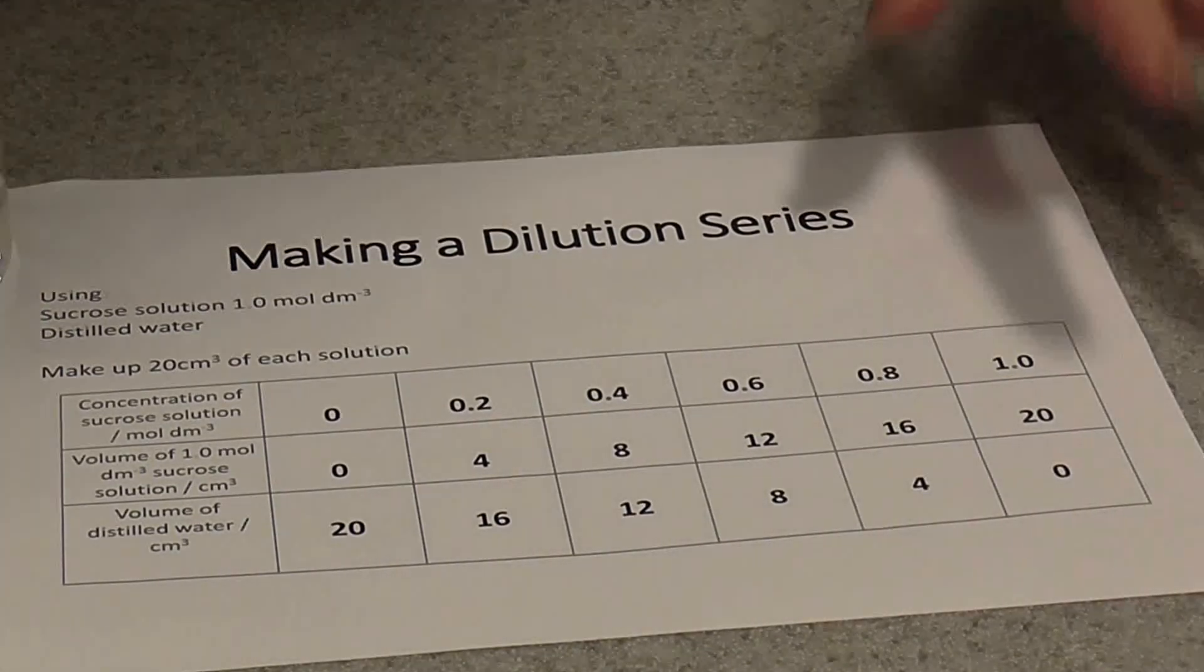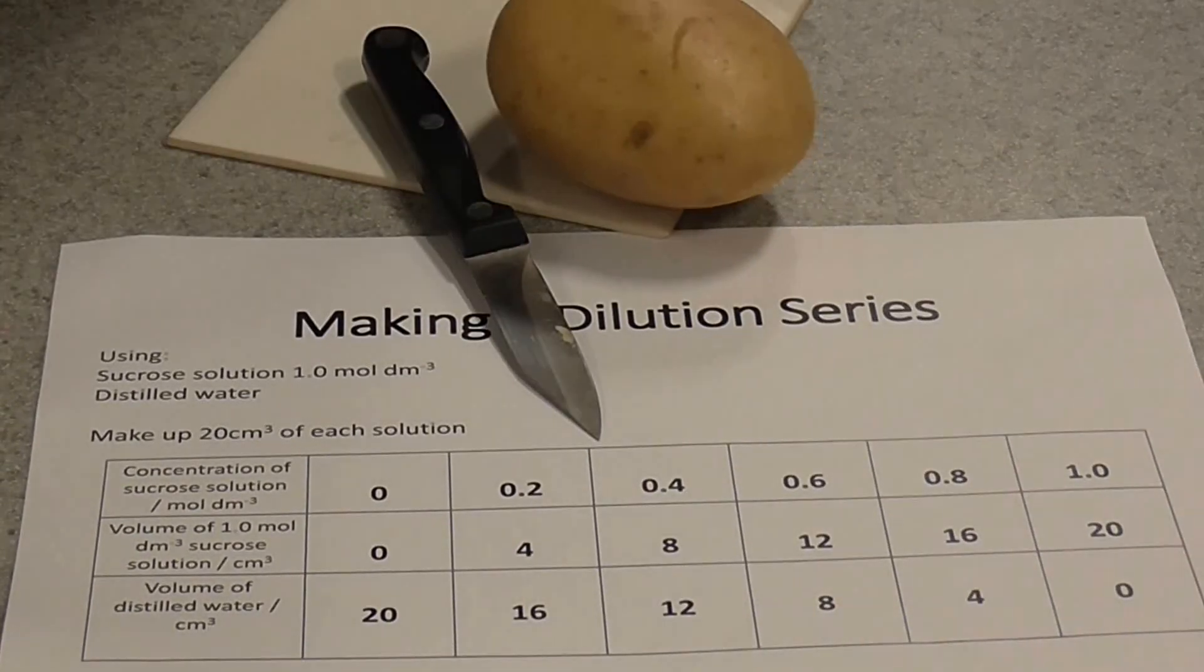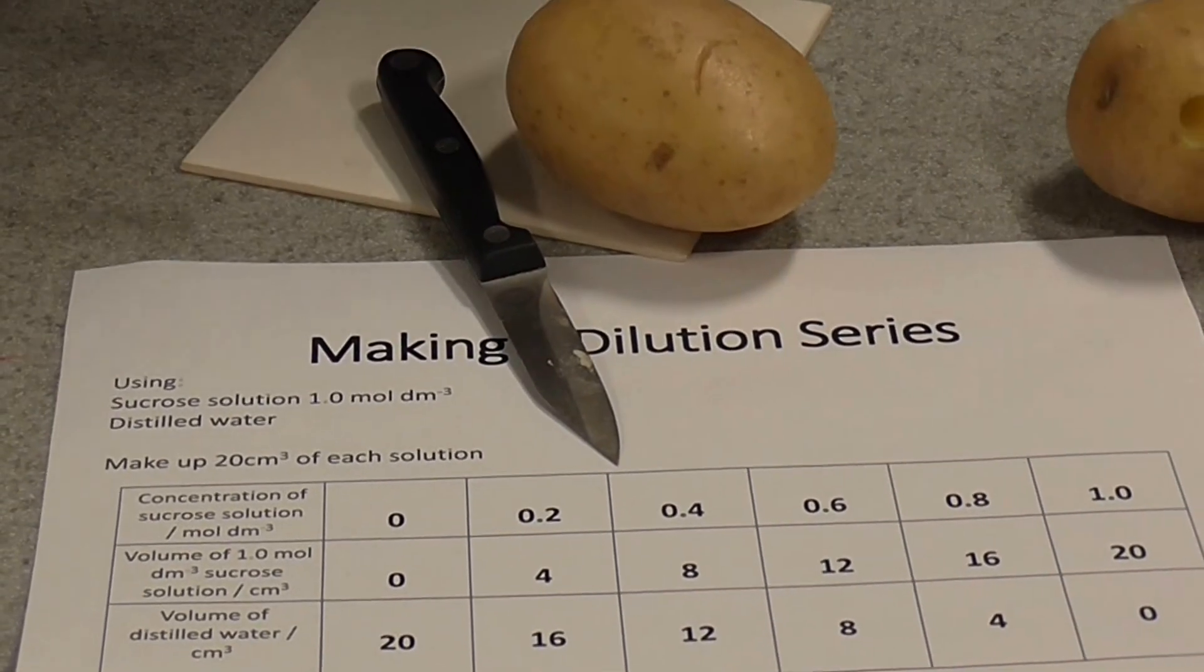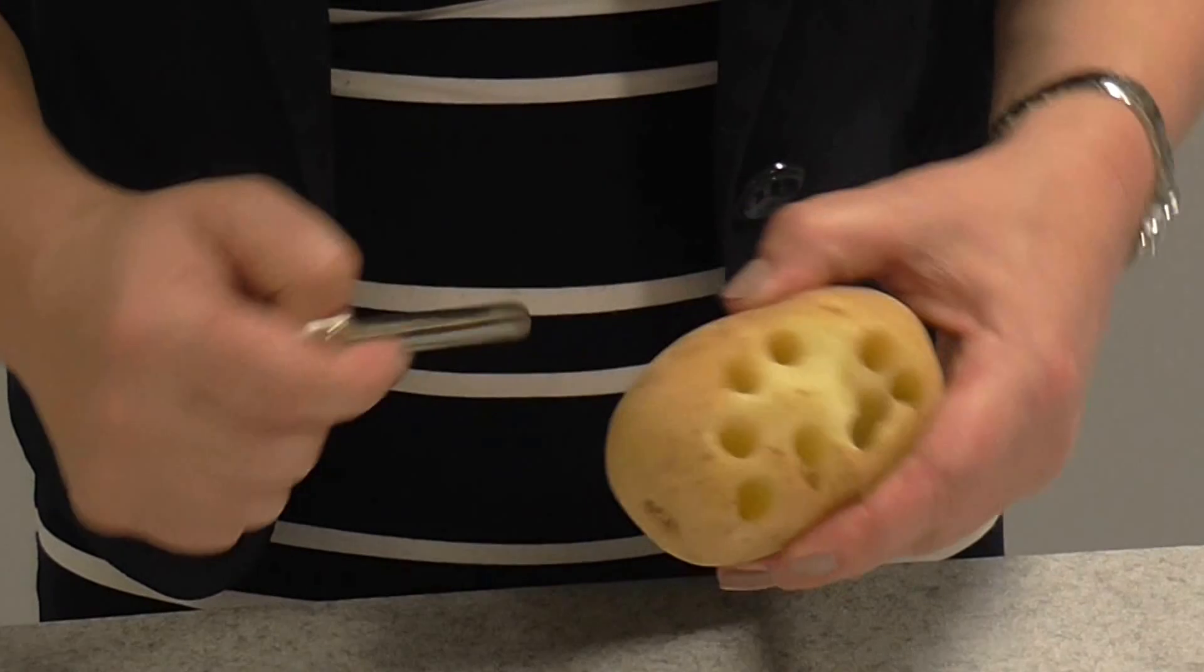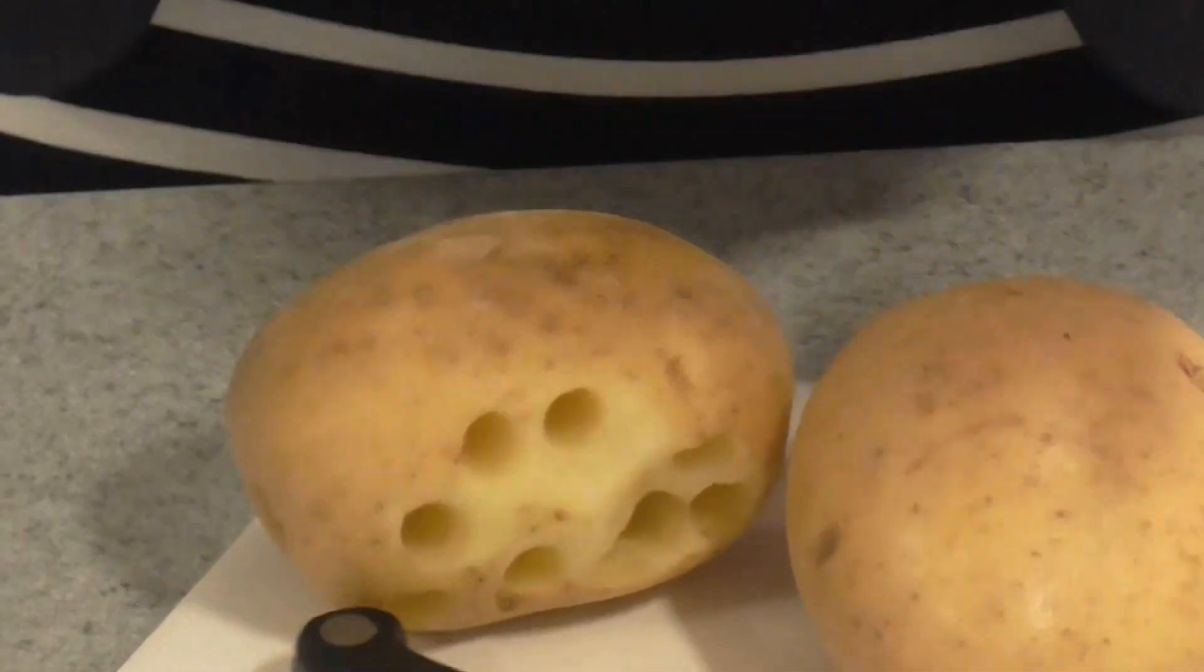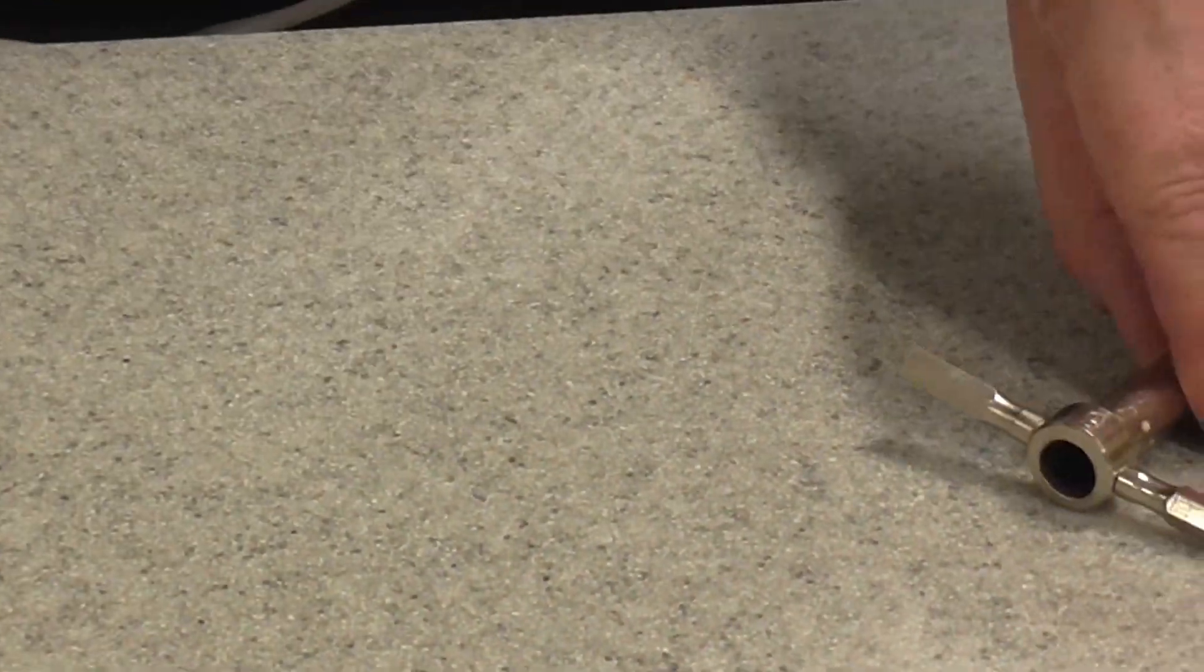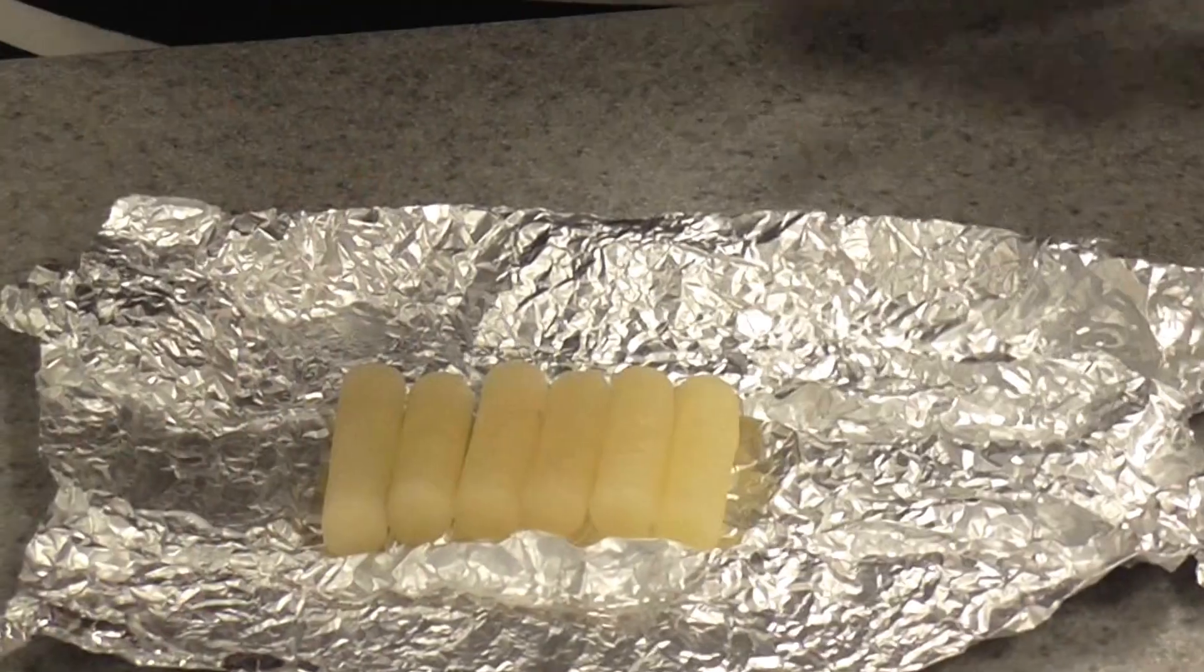Right now while they are equilibrating, we're going to prepare some small chips of potato. The best way to do this is to use a number 6 cork borer, there we go, and we can actually cut, you can see I've done it here, little cylinders of potato tissue. You can actually use a chipper if you like, a chipper's better if you're making a large number for a large class or something like that. Make yourself some little cylinders of plant tissue and then you need to cut them all to a very similar size. Now I've already prepared these earlier and I've wrapped them in foil so they don't dry out. And there they are, that's what they should look like.